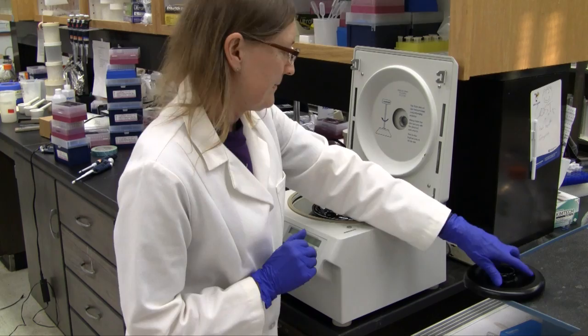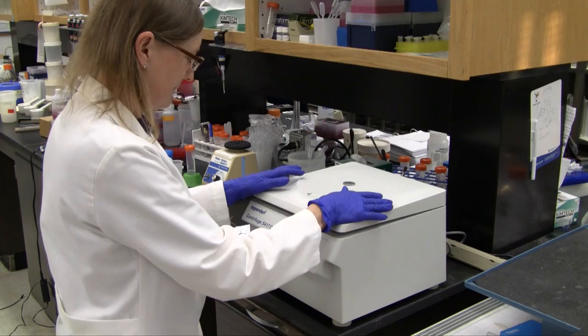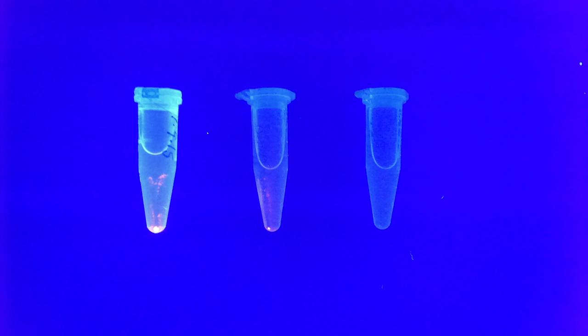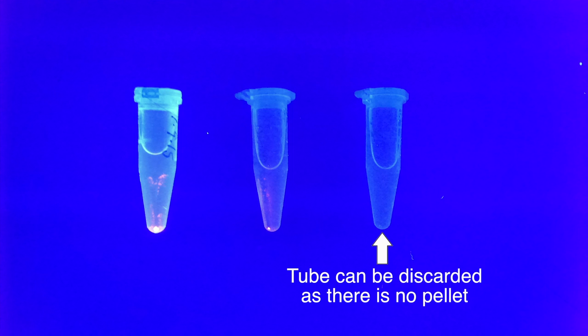The DNA is pelleted the next morning by centrifuging for 30 minutes at 16,000 g. The tubes are examined following centrifugation to check for proper pellet formation. The tubes from a column purification should show more DNA present in the first elution than the second or third. If no visible color can be observed in the third tube, it may be discarded. It is helpful to examine tubes under UV light, as it is easier to visualize the pellets and their intensities. DNA frequently adheres to the side of the tube. This issue is addressed later in the video.